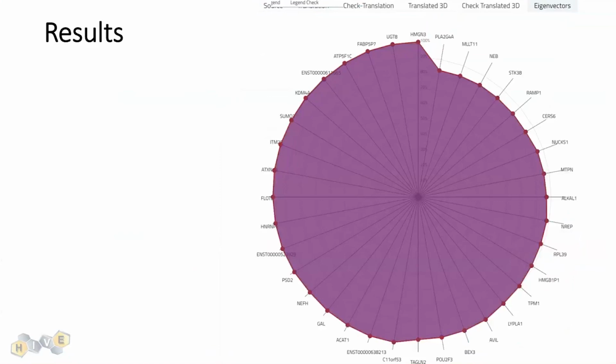And then if you want, you can also check the eigenvectors. This will tell you how important it thinks each of these factors are. And so you'll probably expect to see some sort of kind of seashell shape like this, where the top hits that it thinks are the most important start at the top here, and then it kind of spirals inward from there. There's a limited number that it'll plot here, because otherwise it'll break the browser, but you'll get many of them. So this can be a very nice figure.